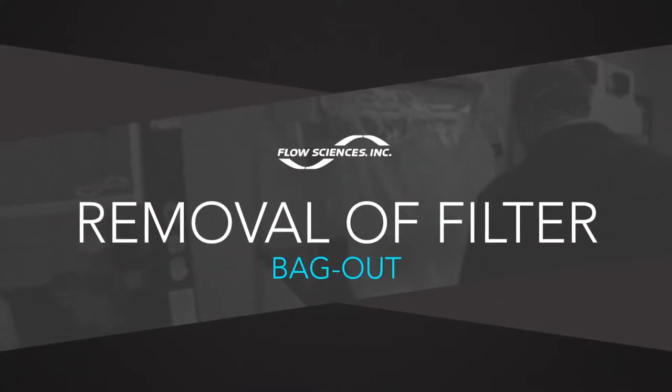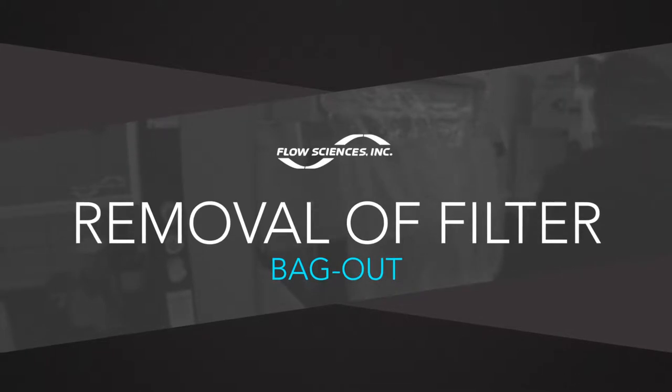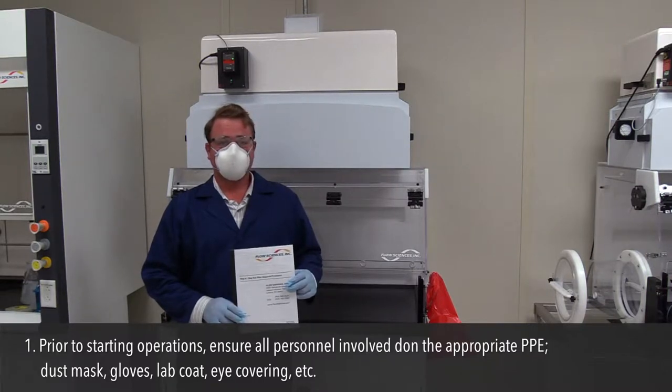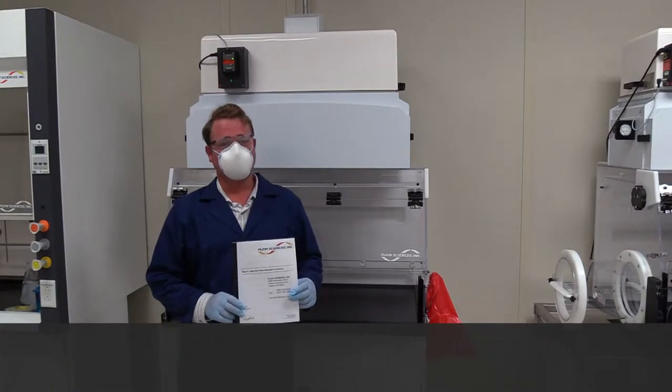Removal of filter — Bag Out. Step 1: Prior to starting operations, ensure all personnel involved are wearing the appropriate PPE: dust mask, gloves, lab coats, eye covering, etc.